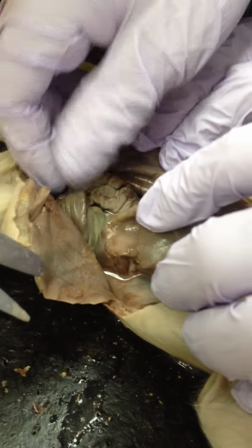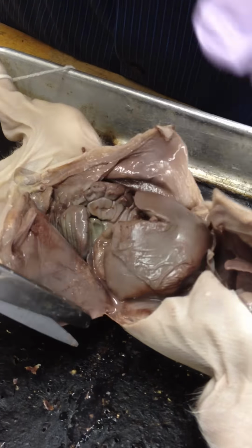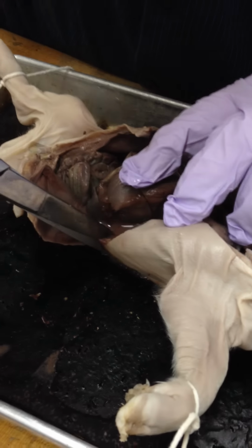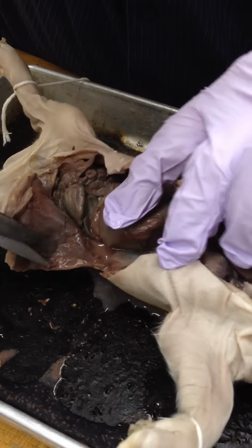Wait a second, is that the spleen right there? Or is that the pancreas? What is this? I thought this is all just part of the large intestines. I thought the pancreas is right underneath the stomach, and it wraps around the stomach. I'm gonna go through some more flesh here and get this all out.